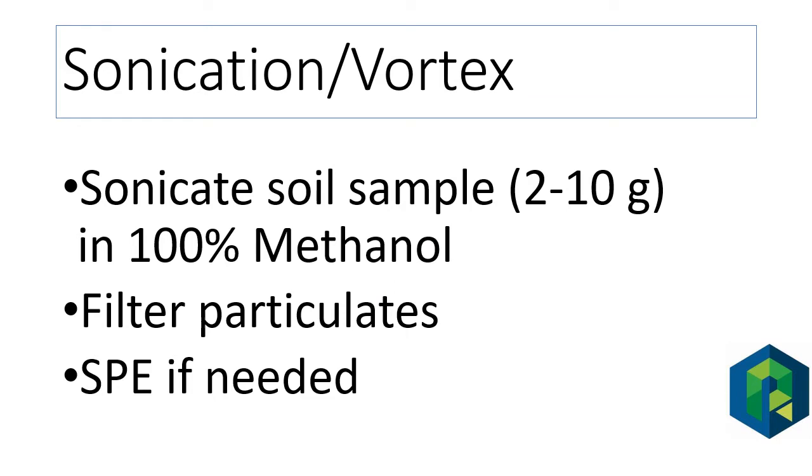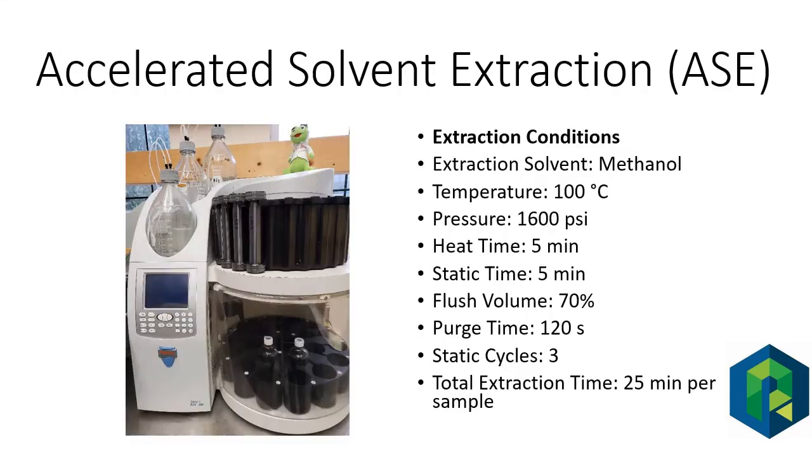So first of all, we would use sonication or vortex, where we'd sonicate the soil sample in 100% methanol, filter out particulates, and SPE the methanol extract if needed, but essentially just analyze it from there.